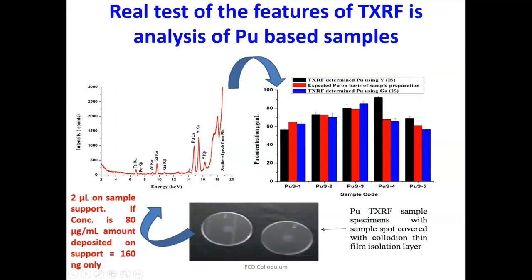On the basis of both the gallium and yttrium, we analyzed the samples and compared the results with the TXRF using gallium as internal standard and the expected concentration. And TXRF determined with the internal standard, these results were very, very matching. And we compared the result with biamperometry also. There also the agreement was very, very good. So this was a very good application.